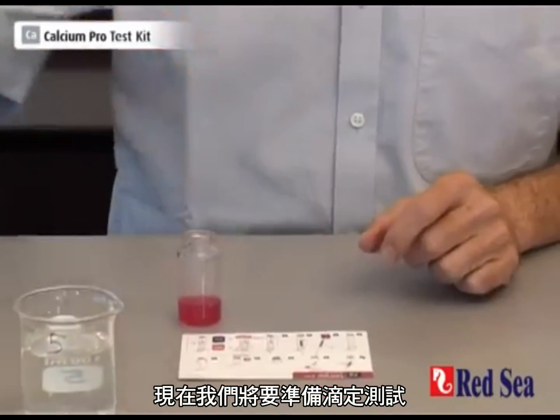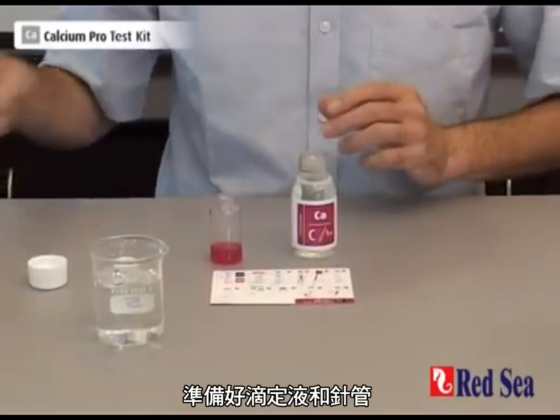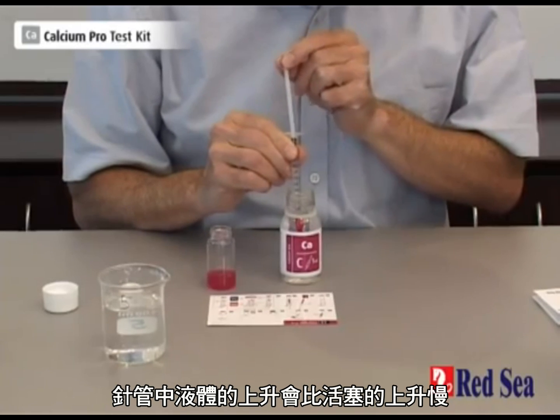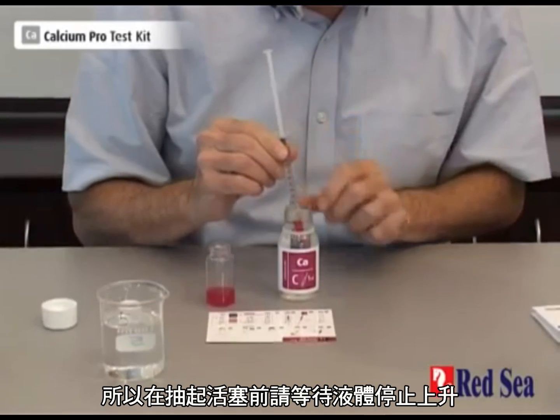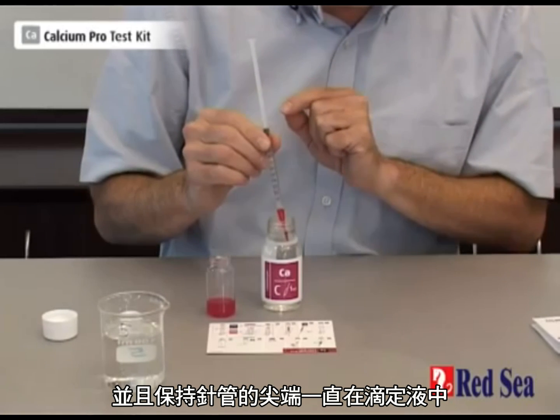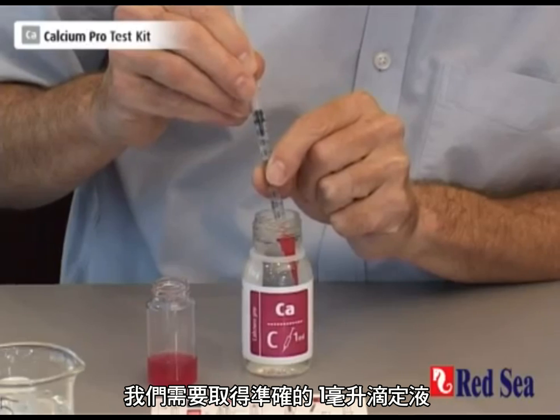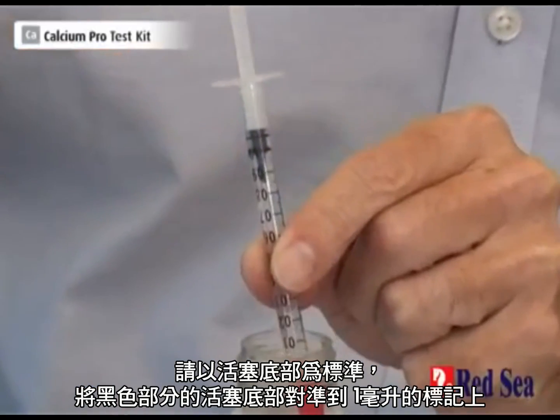We're now going to prepare the titration. We take our titrant and our syringe. You put the syringe into the bottle of titrant and slowly draw up the plunger. The liquid rises slower than the plunger, and you must wait for the liquid to finish rising before continuing. Keep the tip of the syringe in the titrant at all times. We need to take exactly 1 ml, when the black part of the plunger is at the 1 ml mark.